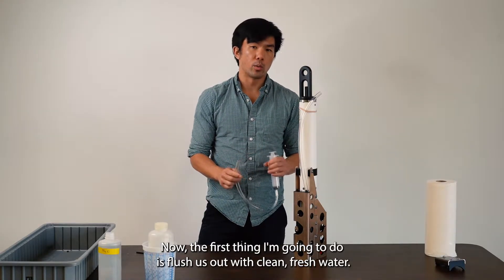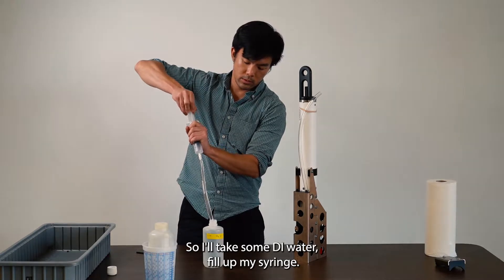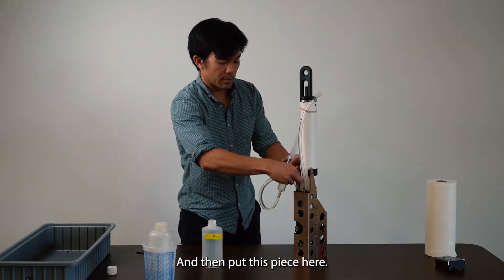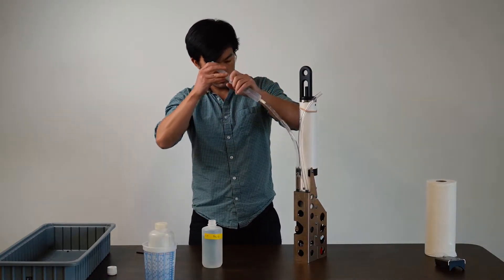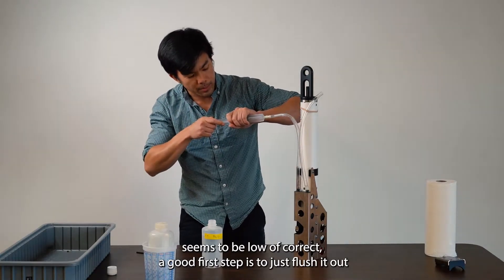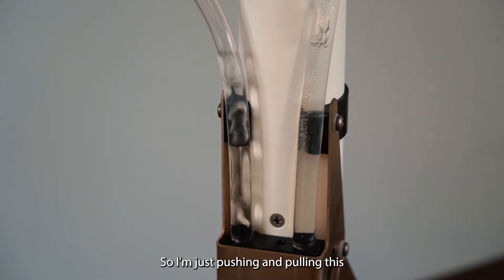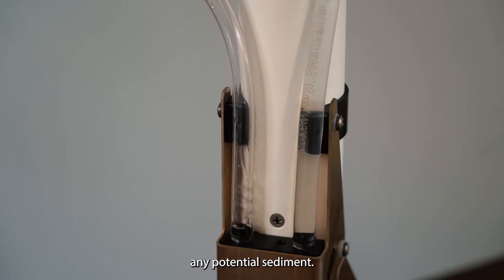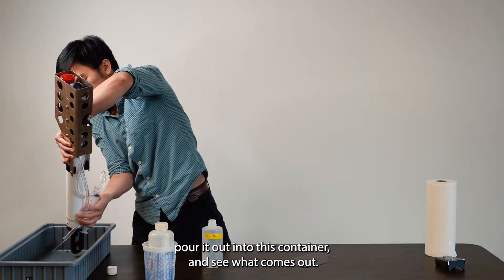The first thing I'm going to do is flush this out with clean fresh water — in this case, deionized water. I'll take some DI water, fill up my syringe, and then put this in place. If you find that your oxygen data or conductivity data seems to be off, a good first step is to just flush it out with clean fresh water and catch the effluent to see if any sediment comes out. I'm just pushing and pulling the water through the flow path to loosen any potential sediment, and then pouring it out into a container to see what comes out.